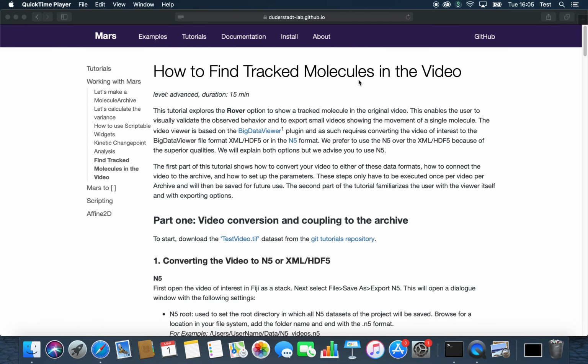Welcome back. In this tutorial, we will figure out how to connect your traces back to your original video. This can be very useful to find out if your findings are real.